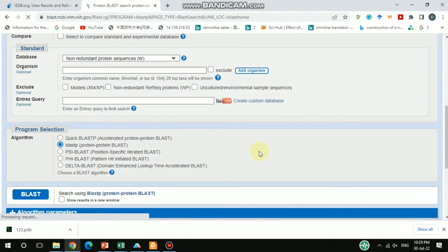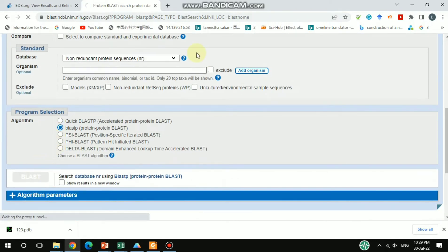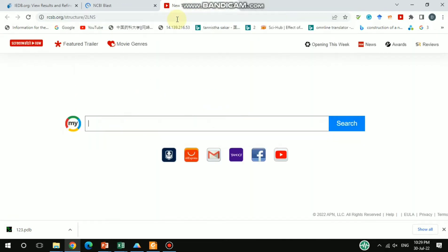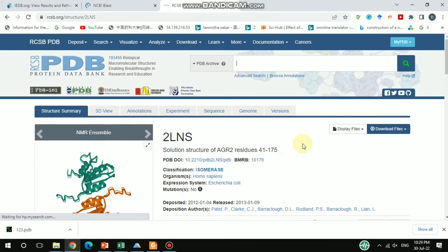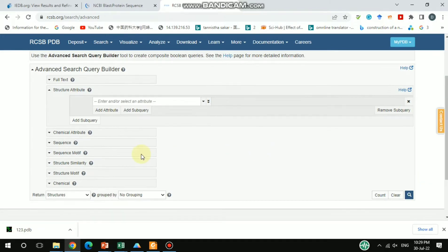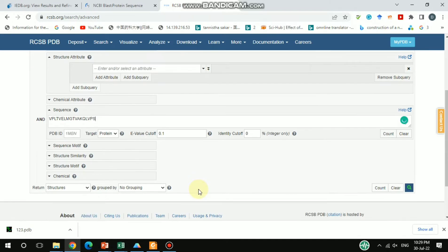Paste that sequence and then BLAST it, and you will get the information. Additionally, I'd also like to search in the PDB database, where you can get the PDB file. I'll go to advanced search and you get this kind of interface, where you can choose the sequence option and then paste your desired sequence and search it.